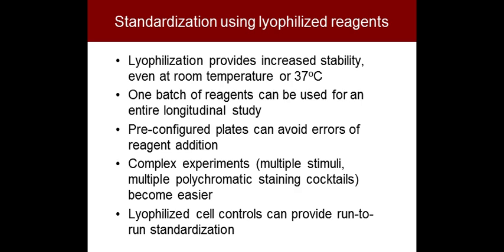That would avoid errors of reagent addition, so you can have your cocktails laid out in a plate, as many wells as you want, and now you just add cells, and you don't have to worry about individually adding each particular antibody. That makes your complex experiments, where you have maybe multiple different stimulations and multiple different staining cocktails, much easier. And finally, you can provide controls on those plates that are actually lyophilized cells to have some kind of run-to-run standardization, or you can have beads and other kinds of things for that purpose.